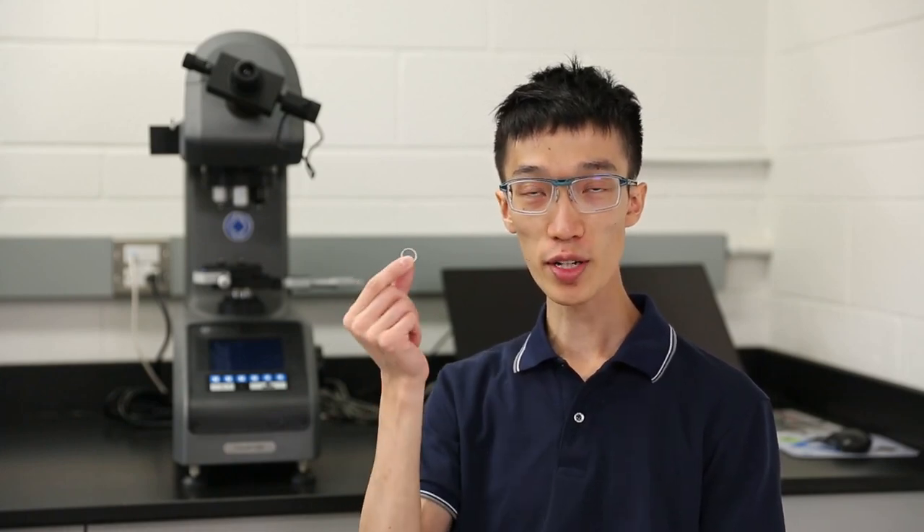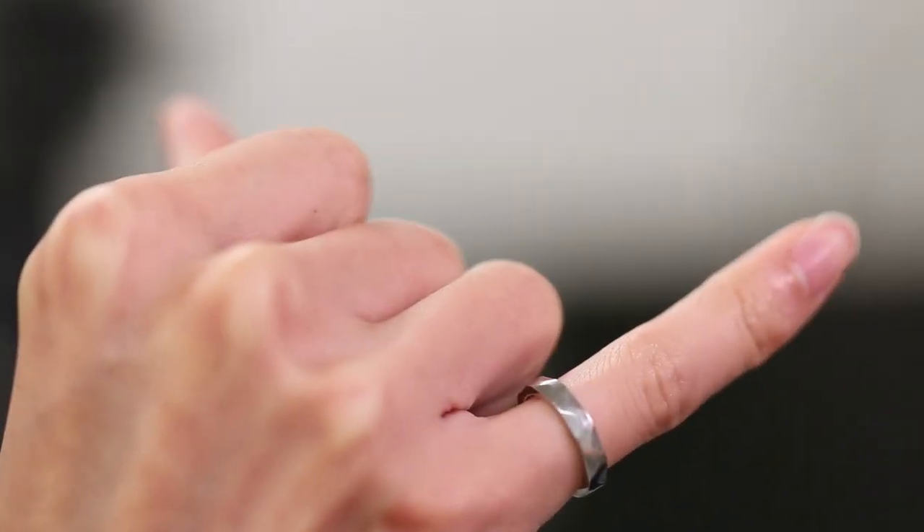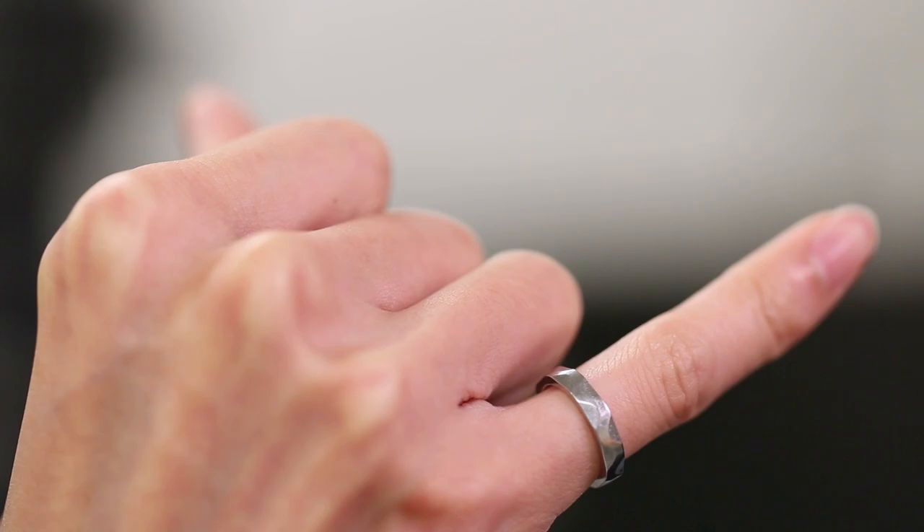Welcome to the HiMacCam channel. In this video, we're going to look at the iron ring in the scanning electron microscope. The iron ring is given to Canadian undergraduate engineering students upon completion of the program. It is typically worn on the little finger of the working hand. The iron ring is a symbol of pride that engineers have in their profession, and also serves as a reminder for the engineer to have high standards of professional conduct.